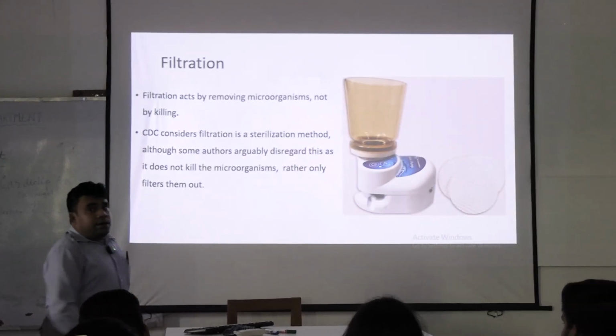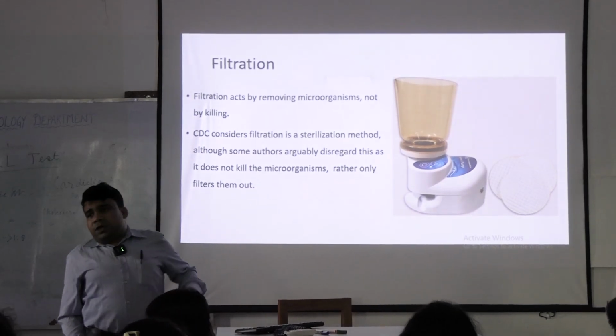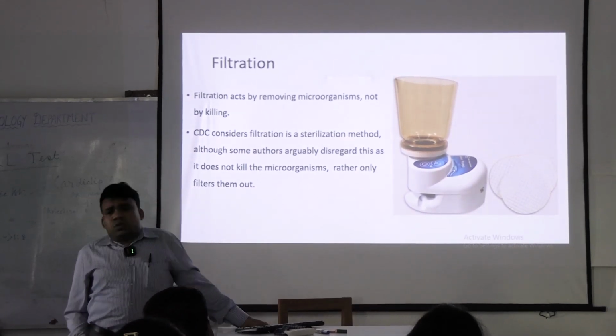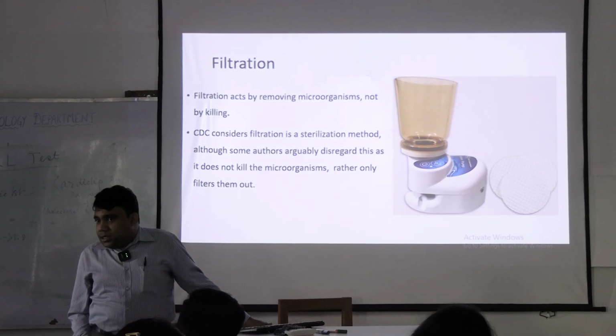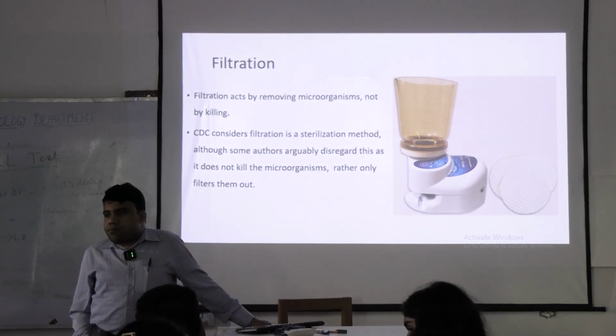Now coming to filtration, I have already told you filtration is used mainly for two types. One is for liquids and one for gas. Now what kind of liquids we need to sterilize? Any idea?